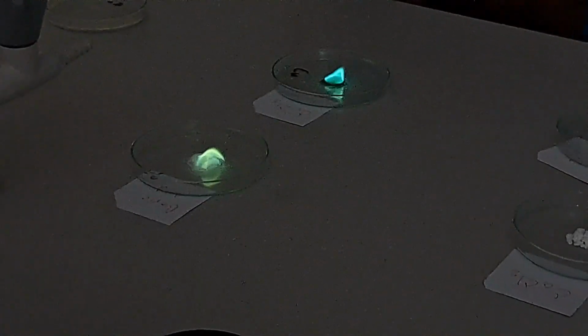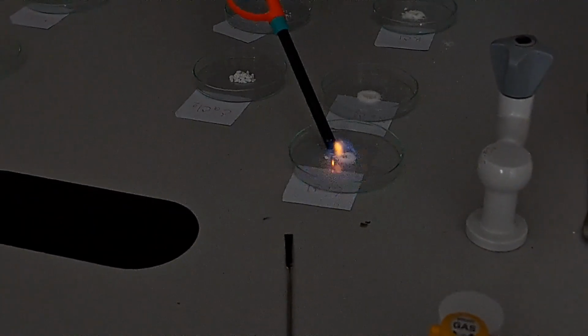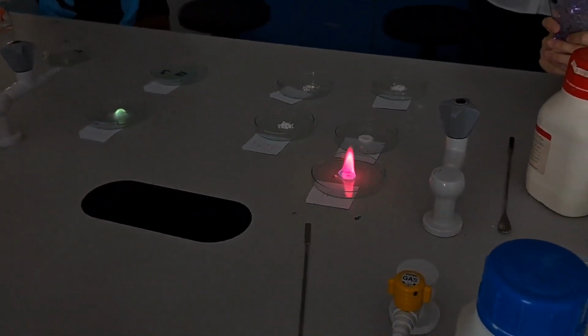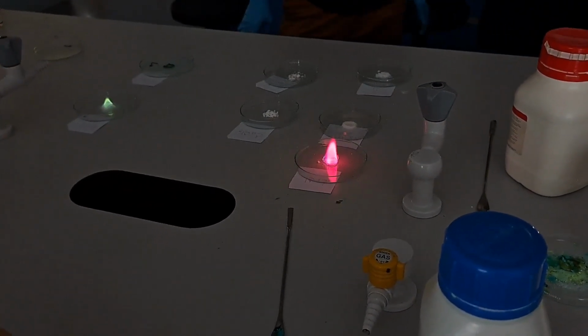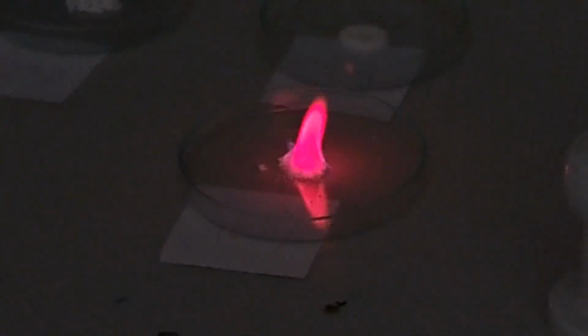Okay, and the last one will give you more wow. This is lithium chloride. If I'm not hearing wow, I will be disappointed. Wow. Is it actually wow, or is it pretend? It's so pretty, so pink and bright. Yes, lithium chloride. Alright.